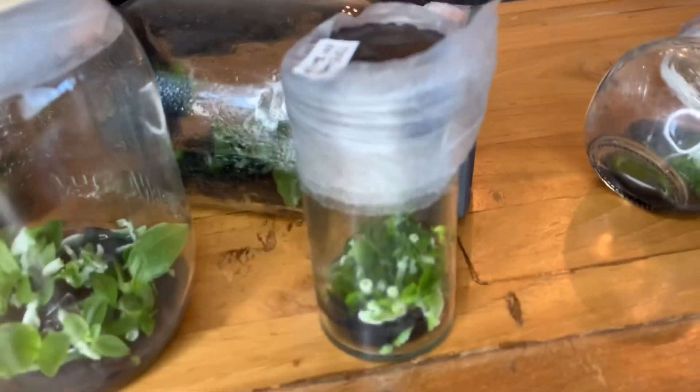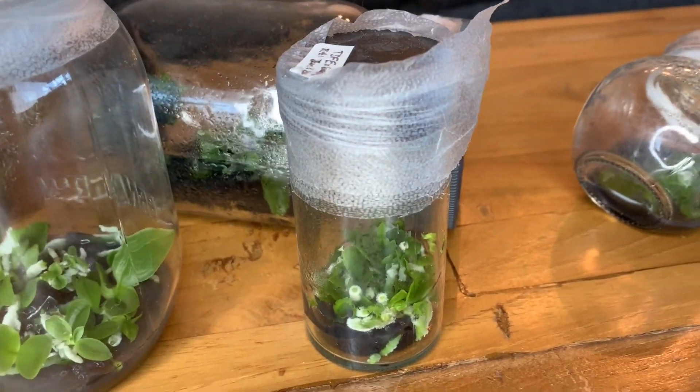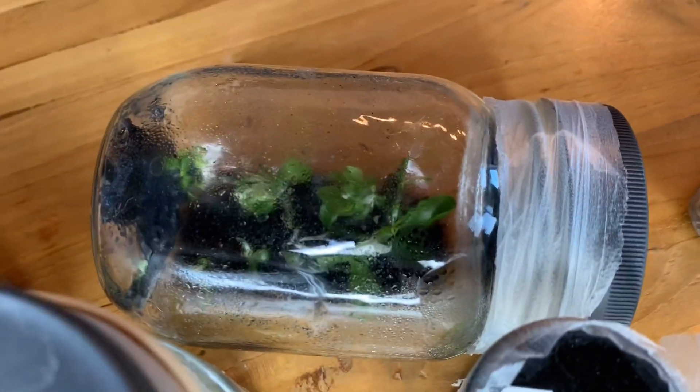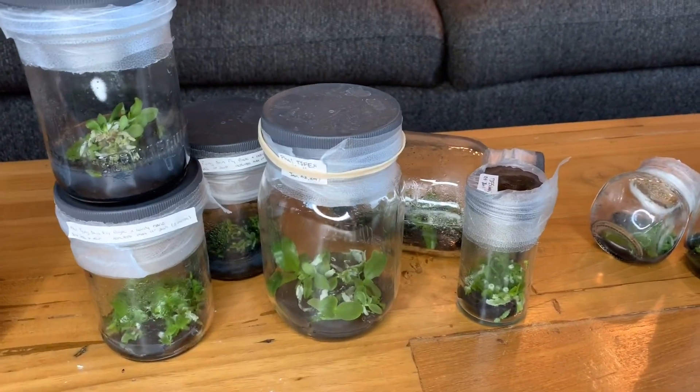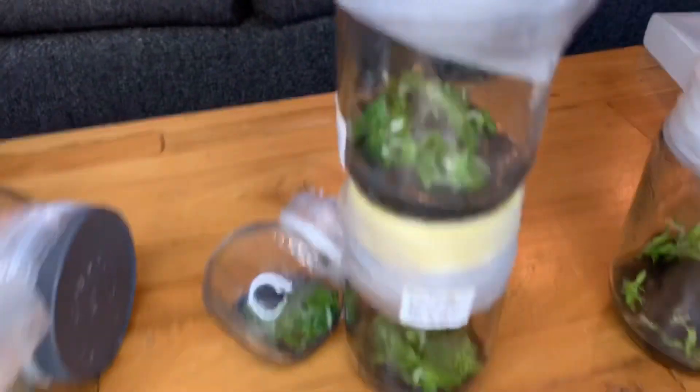These ones need to be replated. The one in the back I had also done recently and they're fairly large in there — they're coming along well, much bigger than they were, which is awesome.